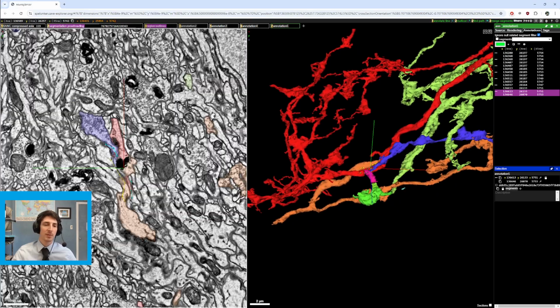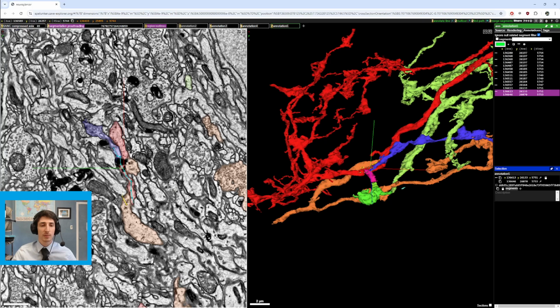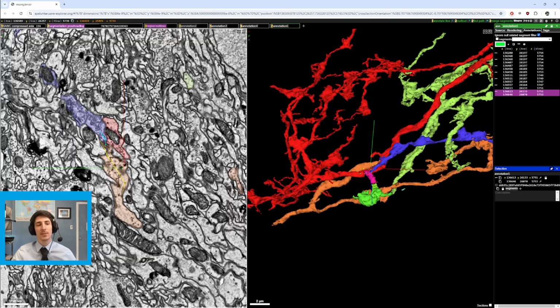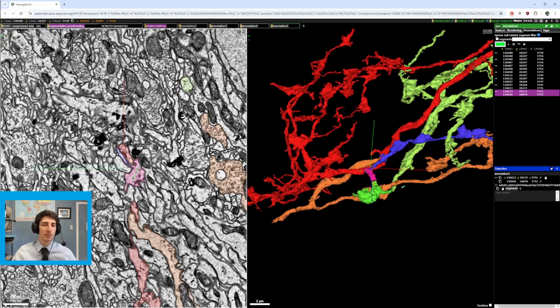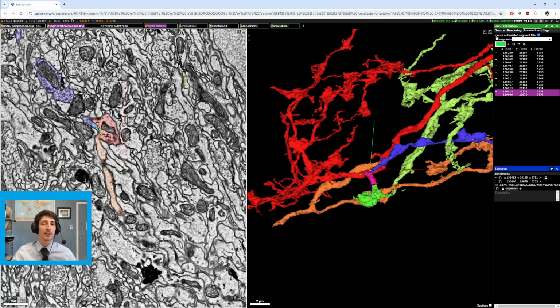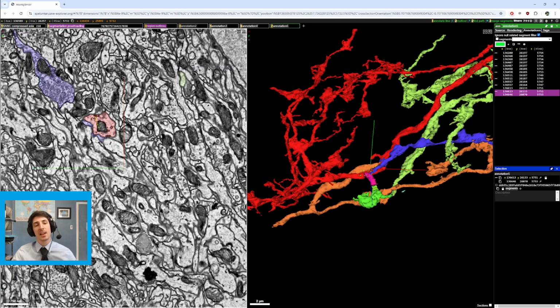So when you have more than two paths, or even when you have two, you do have the option of changing the colors of the points. And this can help distinguish the paths for you visually so that you can make a better judgment on whether or not your cell is taking a certain path.